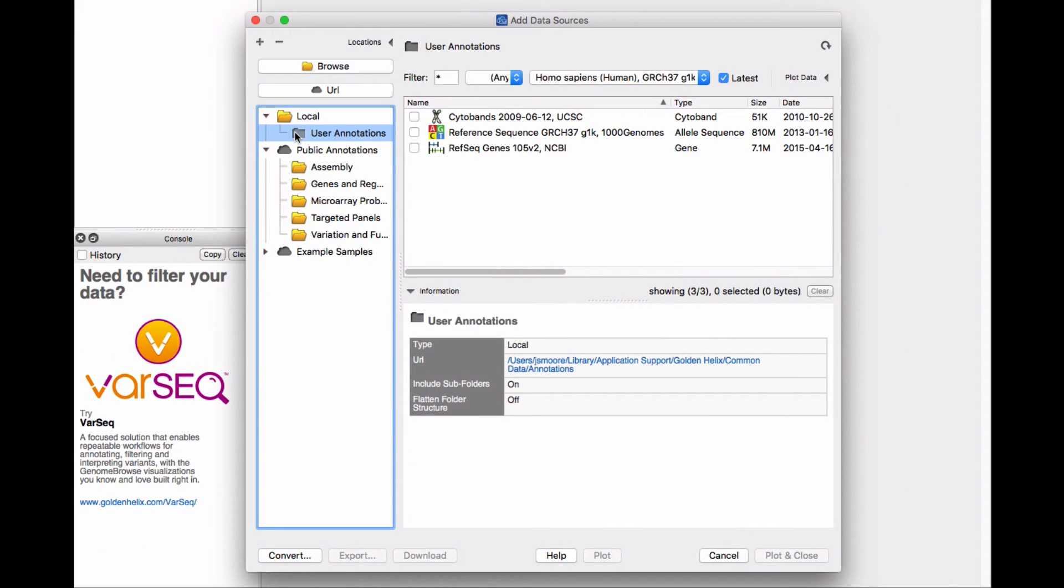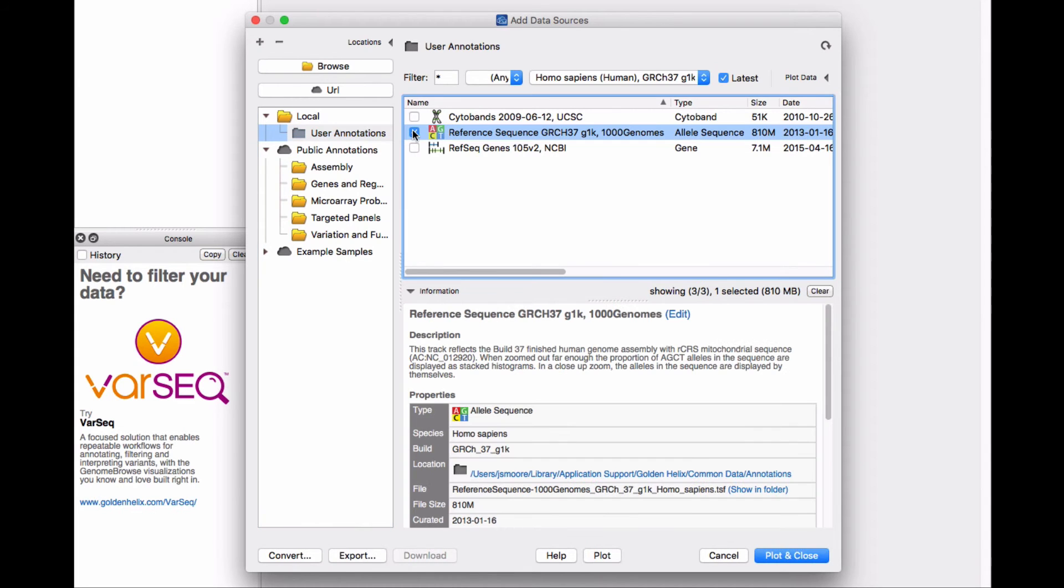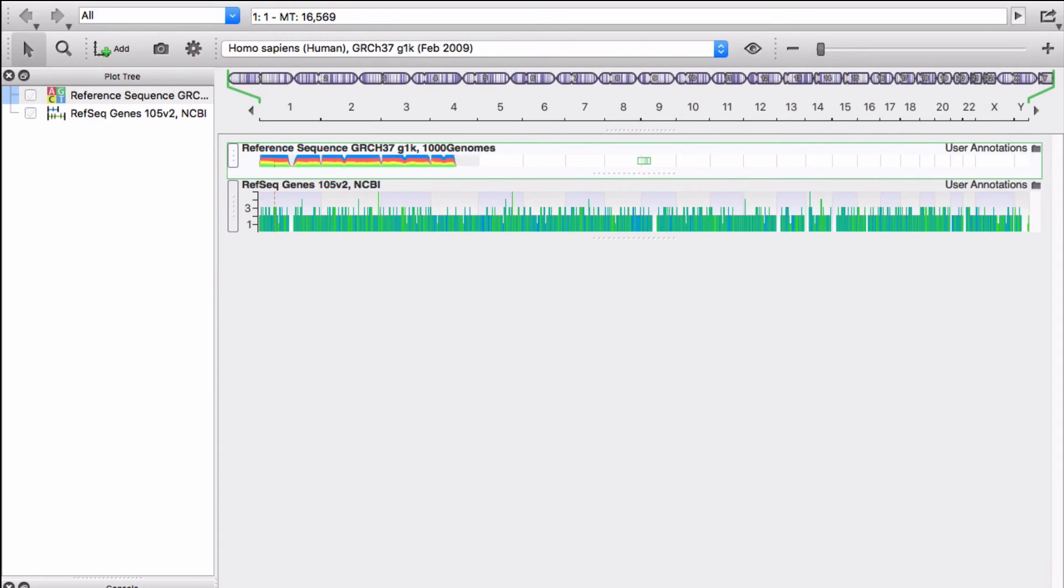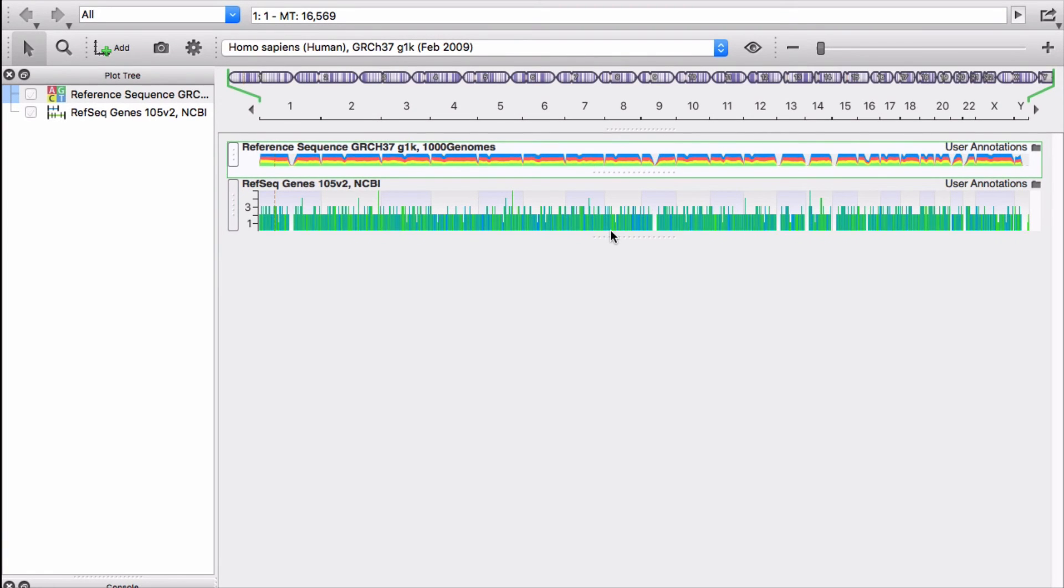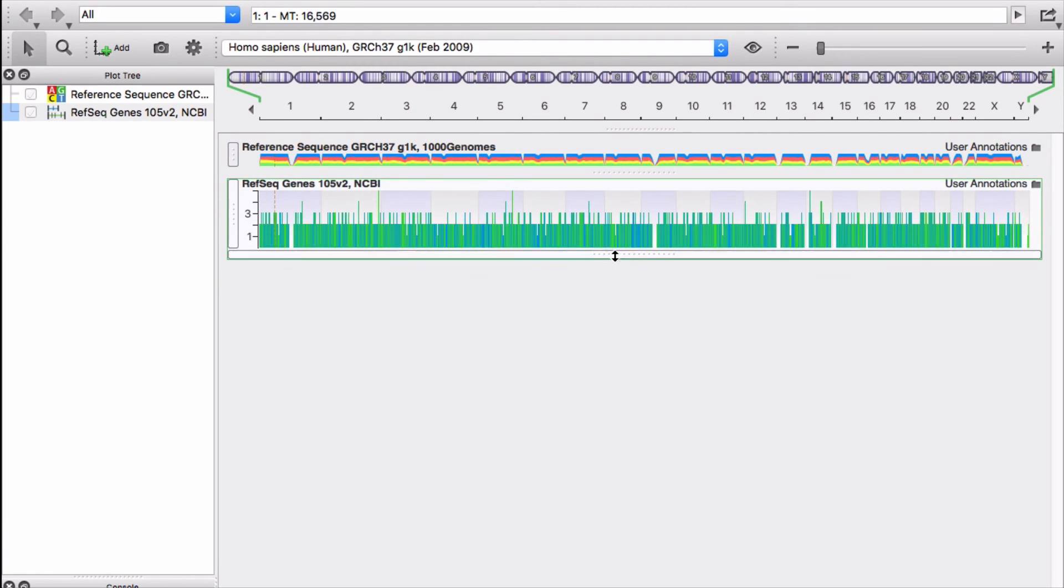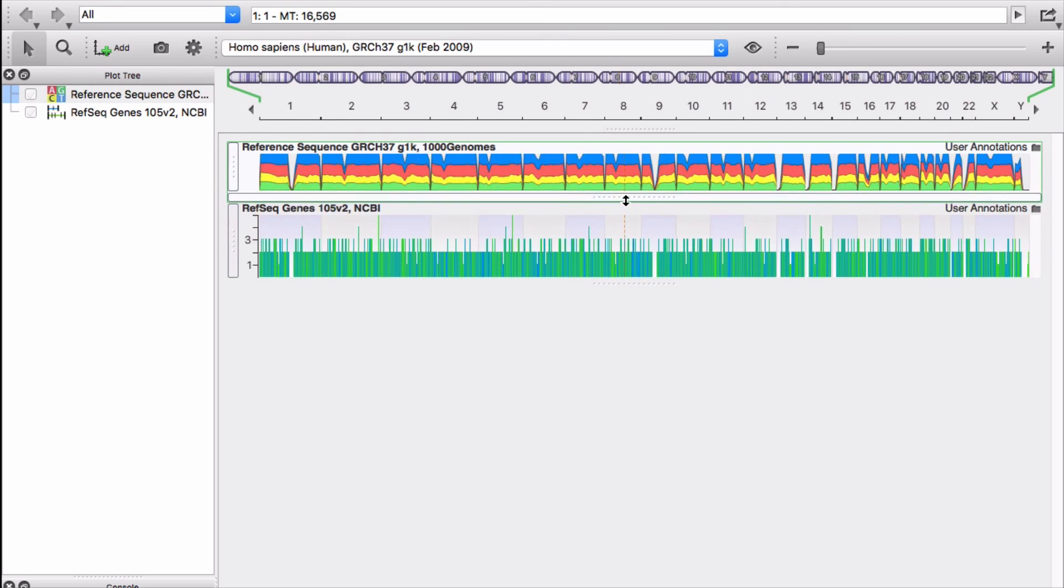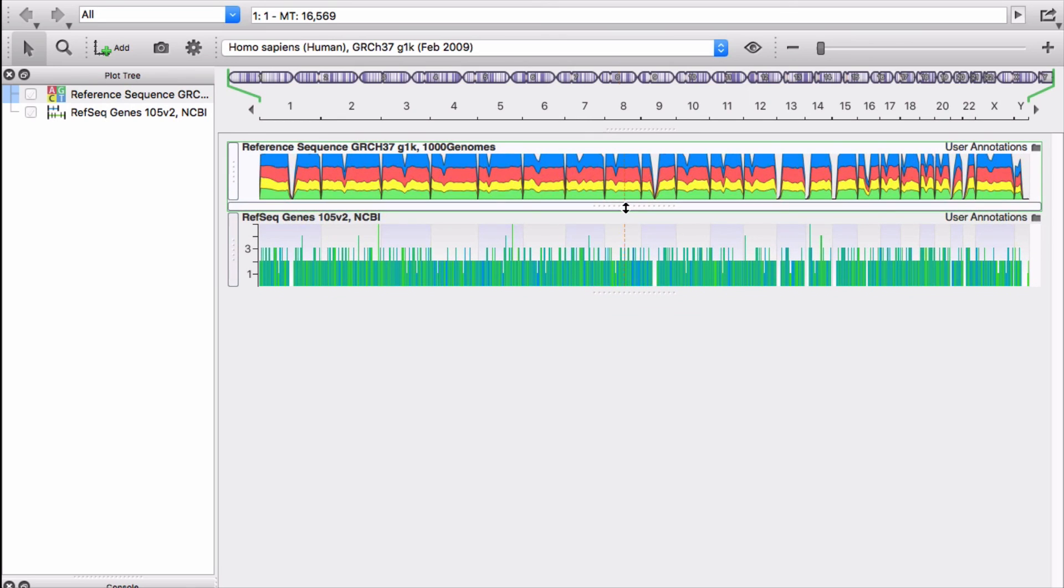Check the box next to reference sequence GRCH 37, then click plot and close. Resize a plot by clicking the grab bar at the bottom of the track and drag up or down to the desired size.